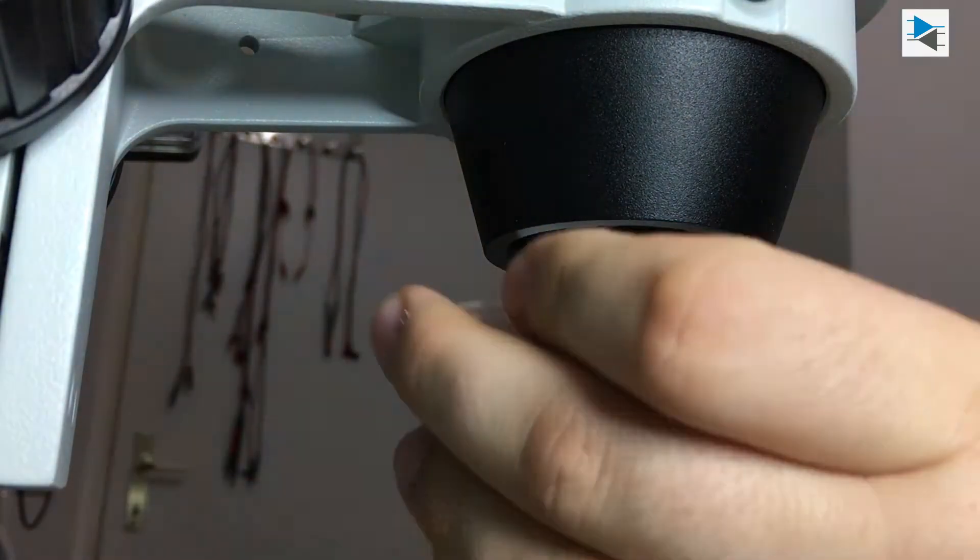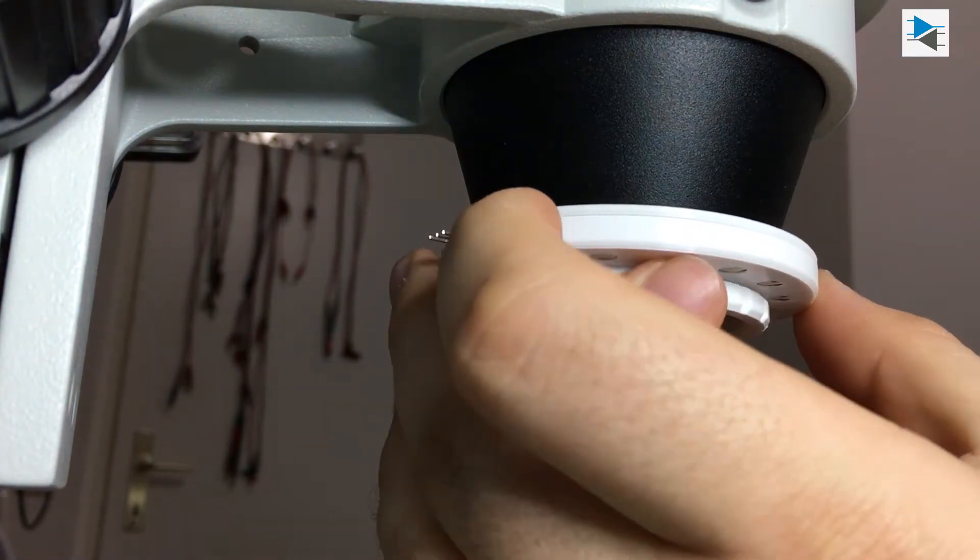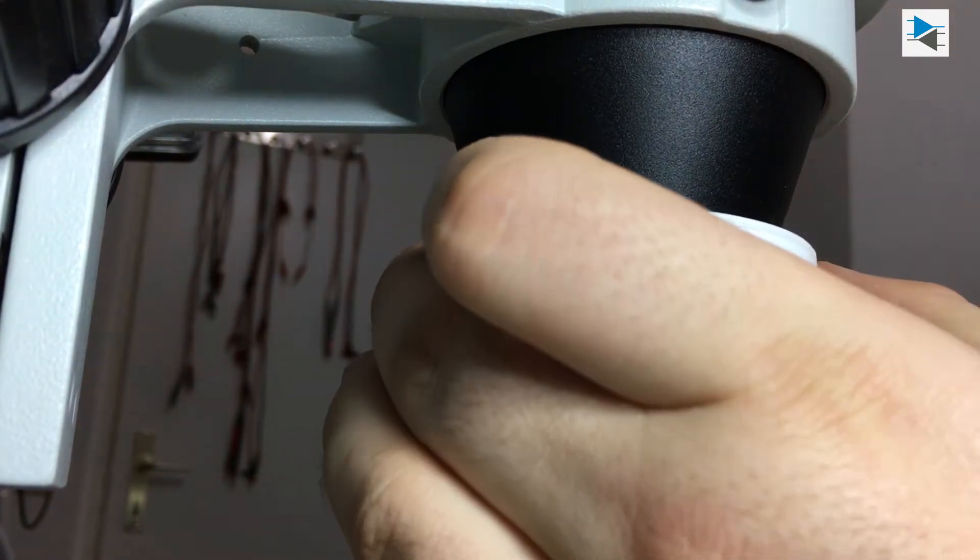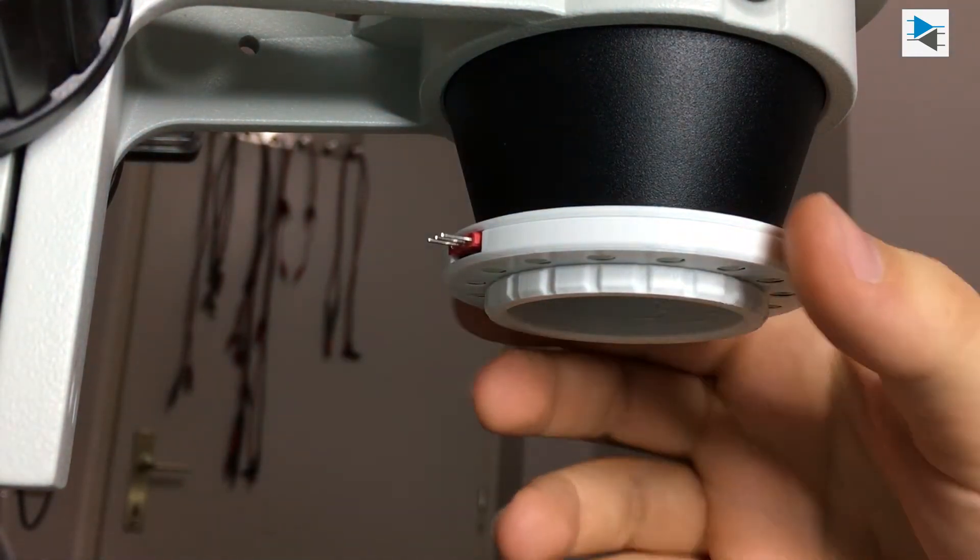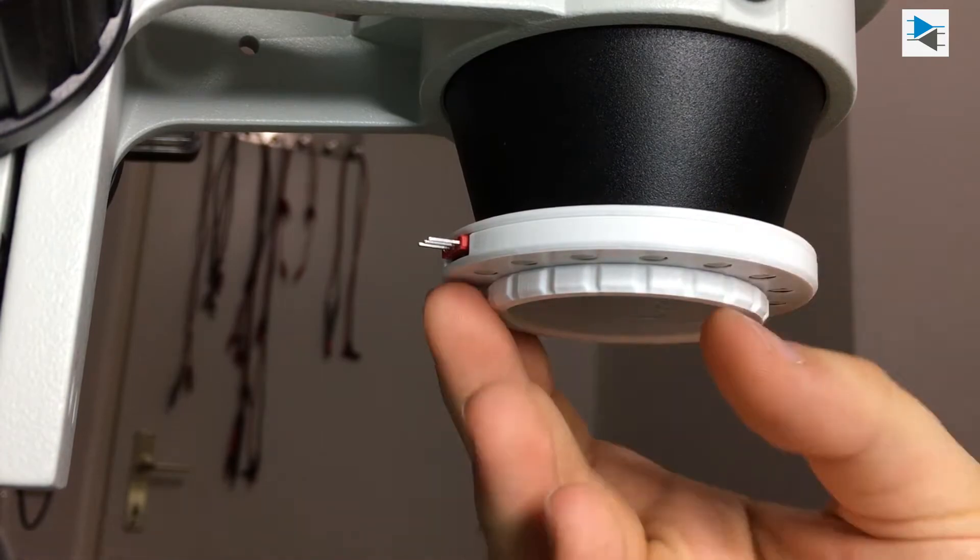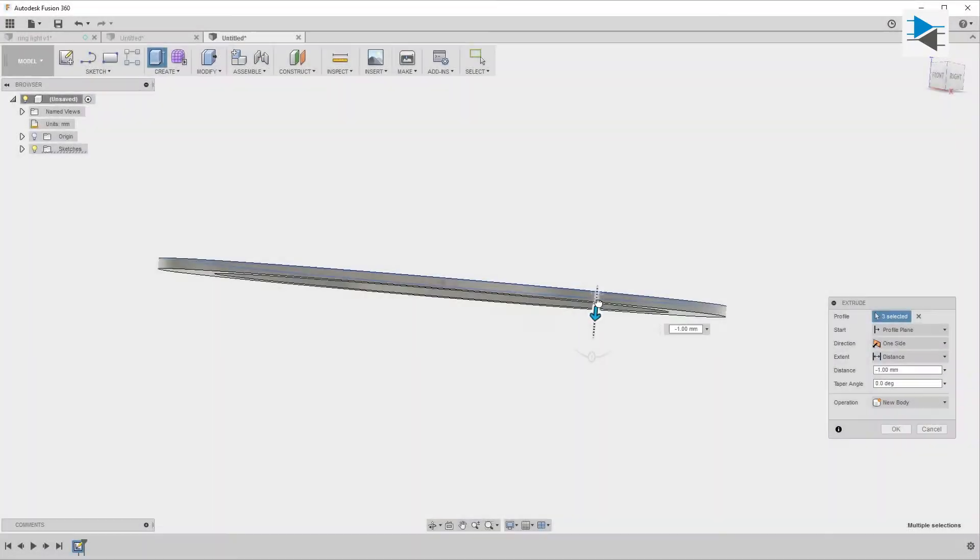Since simple is almost always better, I went with the idea of mounting the ring light holder to the microscope by using the thread for the lens cap.